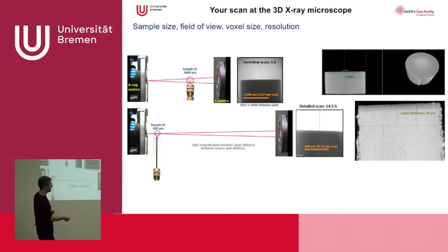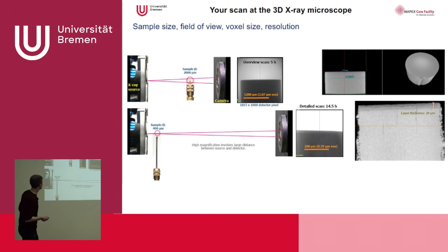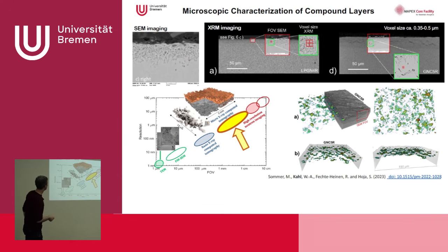That's always an interesting thing, because when you have a sample and you cut it, maybe you impose some destruction on it. So it's always a tricky thing to do. But there are several techniques that can help us. Like we say, we can use also micro-CT in relation to other techniques. For example, if we have this kind of TEM or FIB-SEM, it's always a different field of view in relation to the resolution.